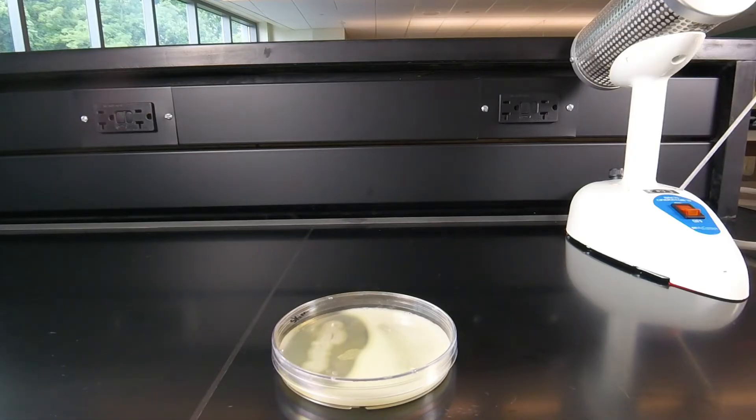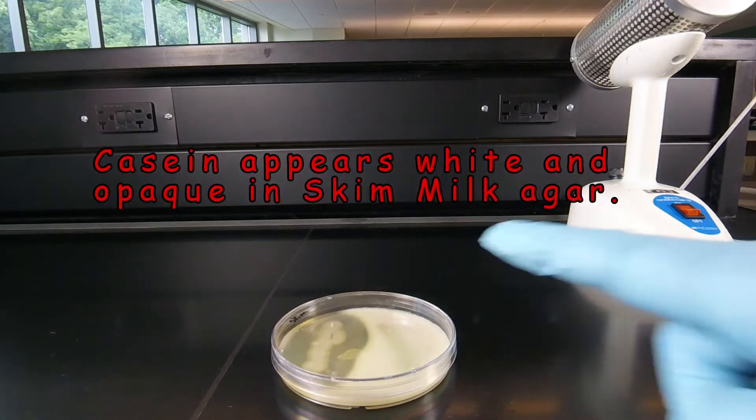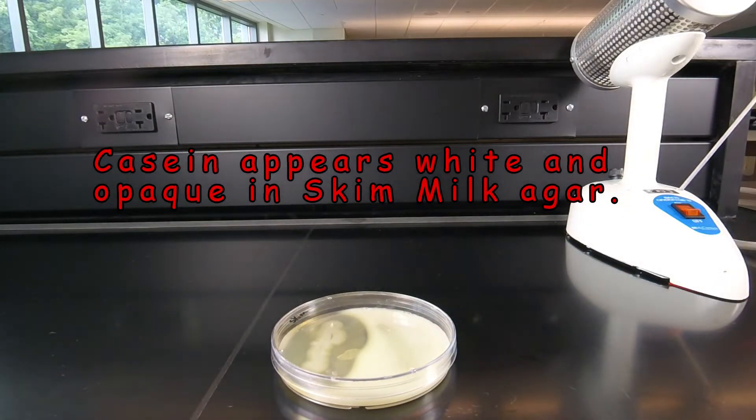It's casein, in fact, that gives milk its white opaque appearance. For this, we're going to be using skim milk agar, which contains the protein casein.